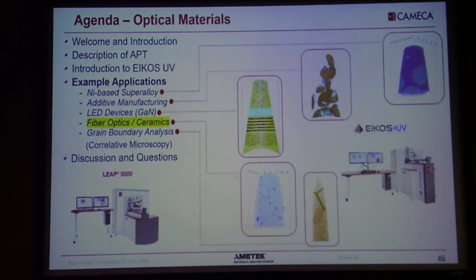Okay, let's talk about fiber optics. That also could vary with the material. If you are working with a silicate-based system, or if you are working with a chalcogenide-based system, for example, the conditions for the preparation and for the analysis would be different.